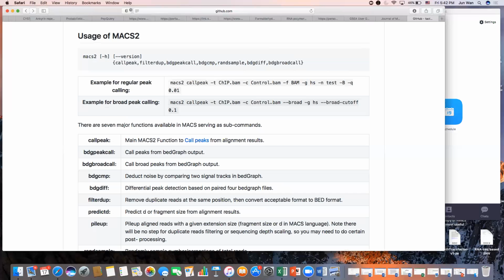Do you have any questions about where to get MACS2, how to install MACS2, or any of these commands? Travis, what's your question? So I just tried to install MACS2. We don't have permission to do it. I tried to git clone it and local pip install, so there's a GCC compilation issue. Okay. So I'm not sure. Maybe you'll have to do one of the system admin installers.